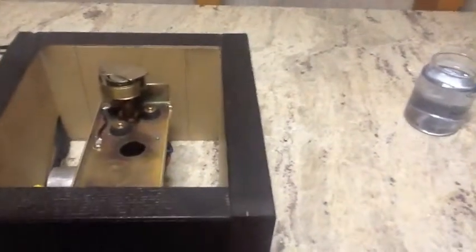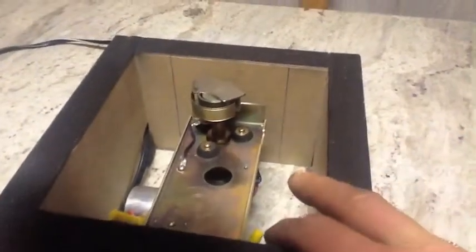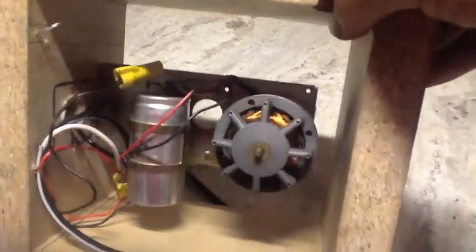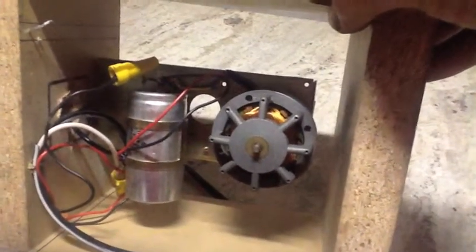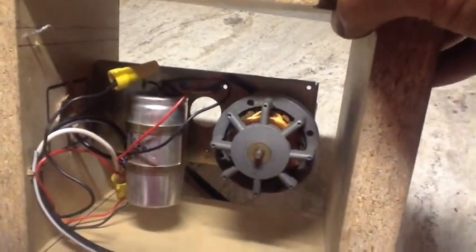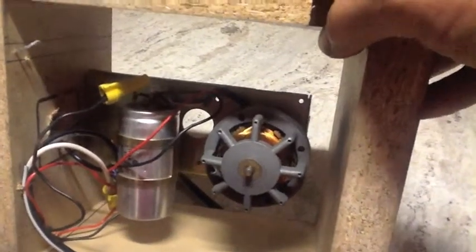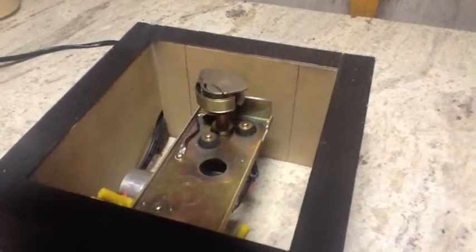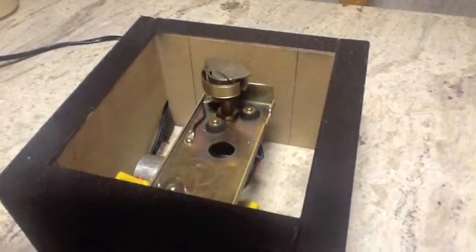The reason why I call this a failure — even though it seems to work beautifully — is that this motor was taken out of a stereo. It's a really cool looking motor, but this thing was made for short duty cycles. This is a cassette deck motor; you fast forward or rewind a tape, it may run for 20 seconds tops. With a magnetic stir plate you're going to be spinning juice for probably 20 to 30 minutes, and this motor was just not made for that. Anything over about 30 seconds and that motor starts to get hot. It's certainly not meant to run for 30 minutes. So I'm going to call this build a failure.